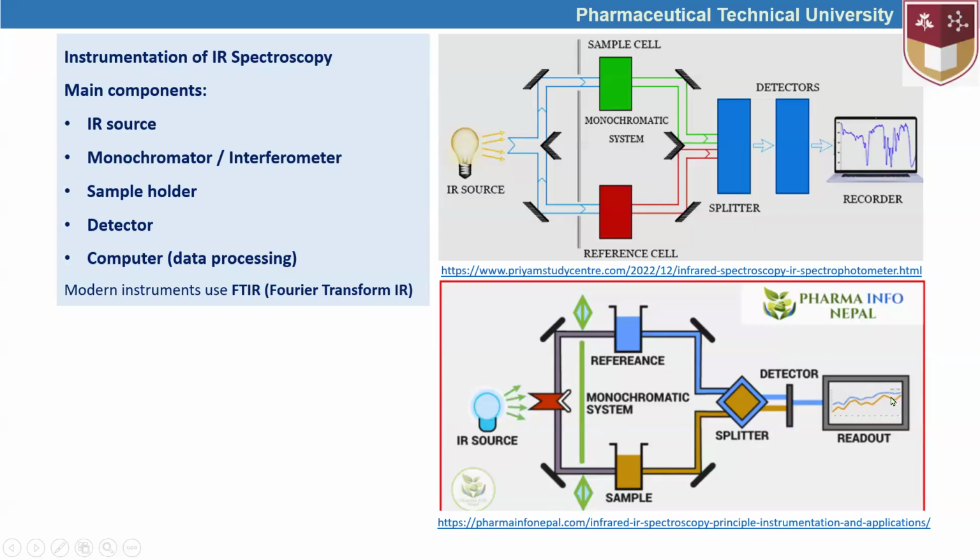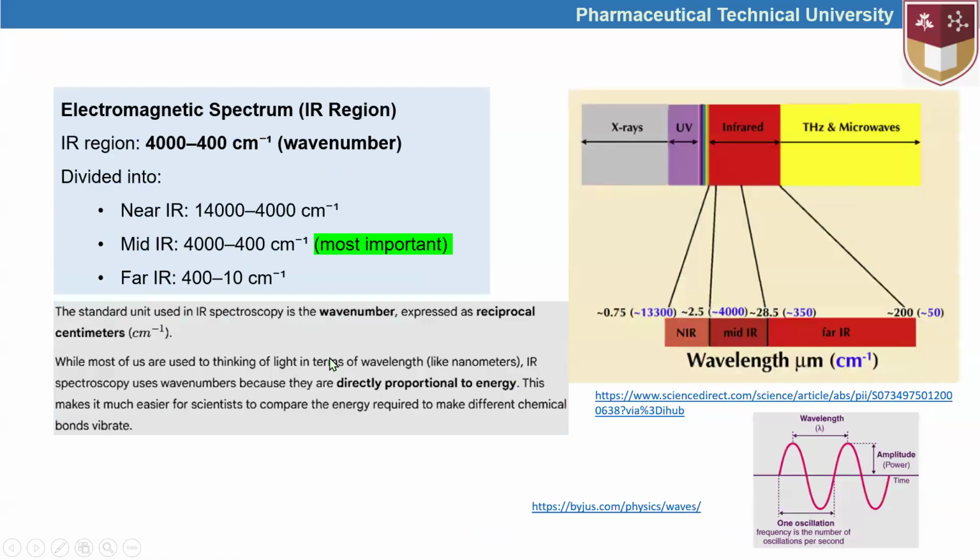Based on the differences in the infrared spectrum, we can suggest some differences between these two samples, the reference and the studied sample. This is a kind of model comparison. Here we can see that the infrared spectrum of various compounds can be obtained. We are going to talk about these things during the whole lecture.